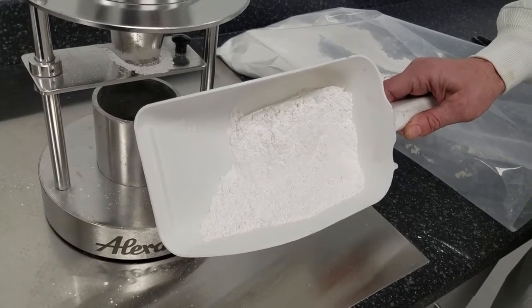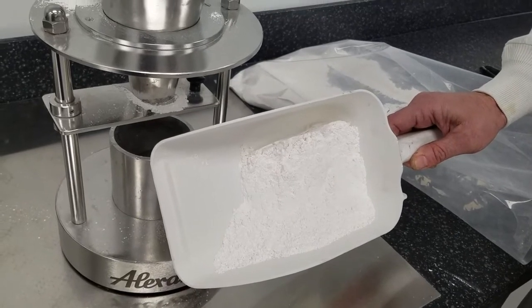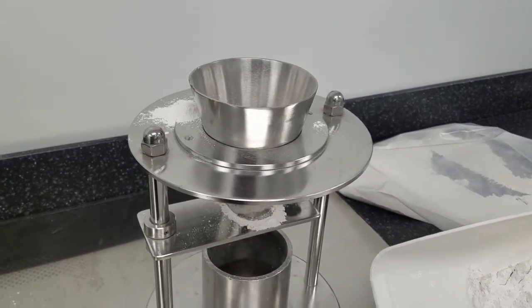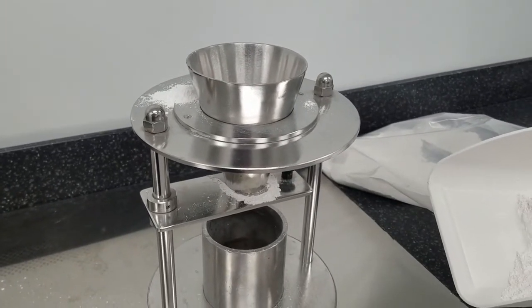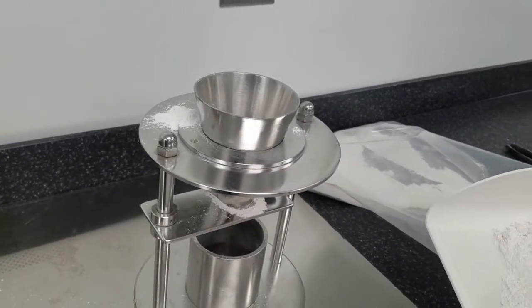To give you a better visualization, let me pour some of this material into the feed hopper that you see in front of me. This feed hopper has about a 75-degree angle on its sides, and once I pour the material in, I'm going to open this discharge valve on the bottom and show you the poor flow properties going into the small collection bin below.